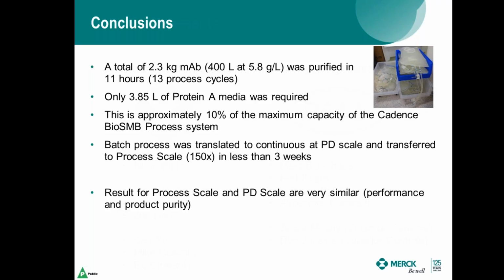All of this work that was presented here was conducted in 3 weeks, so I think one of the messages we're trying to send is that continuous process development doesn't have to be a lengthy process as long as you have a methodology behind it. And the end result is a very scalable process from the PD bench to the process scale.